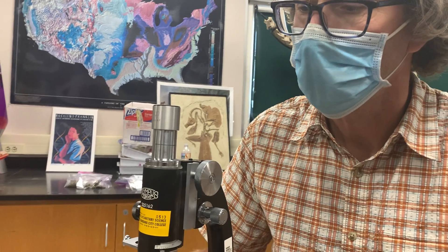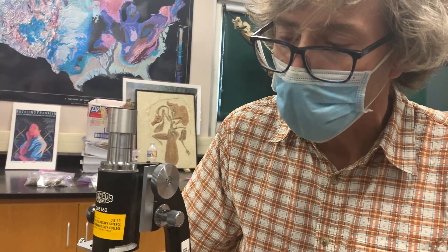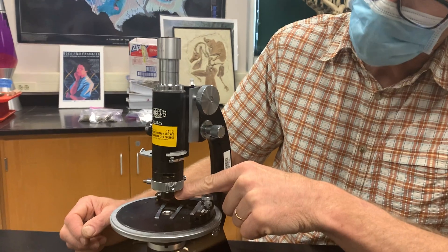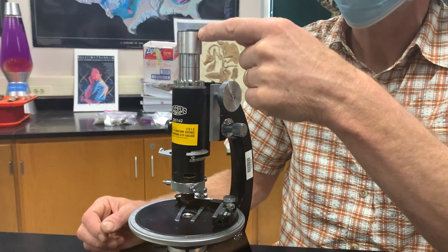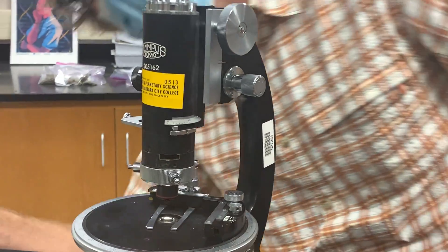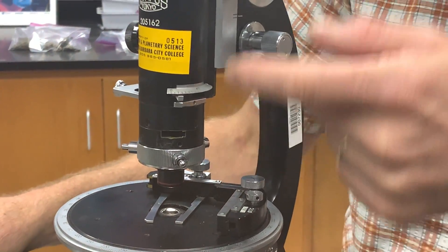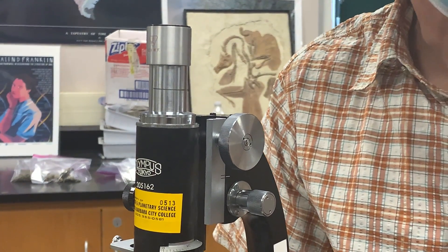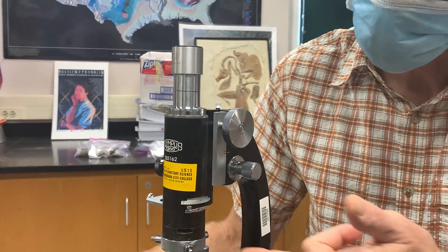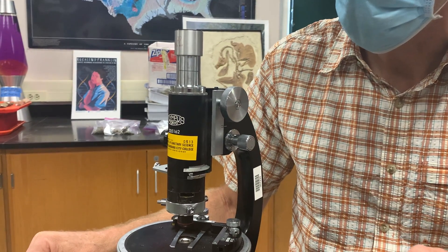Some of you might have microscopes with interchangeable oculars — you can pull them out and change them. You might have a 7.5, a 5, or a 12. For most of what we do, we'll use the 10. The total magnification is a combination of the magnification of the objective and the magnification of the ocular. So if you have a 4-power objective in combination with a 10-power ocular, that would be a magnification of 40 times — 4 times 10 is 40. That's your total magnification.